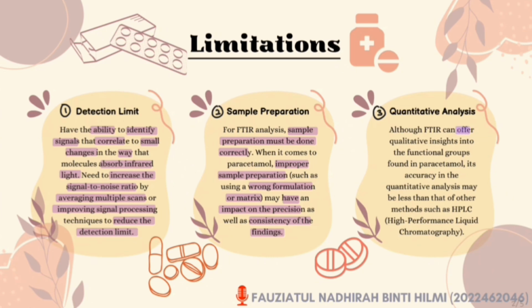Even though FTIR can offer qualitative insight into the functional groups found in paracetamol, the accuracy is less than other methods such as HPLC, high performance liquid chromatography, that have more accurate readings.